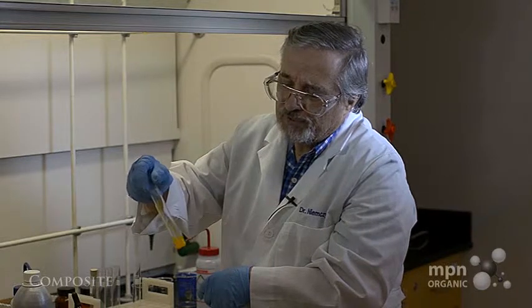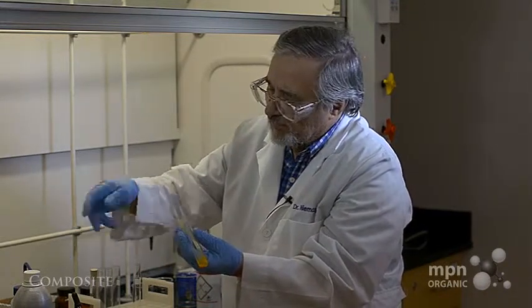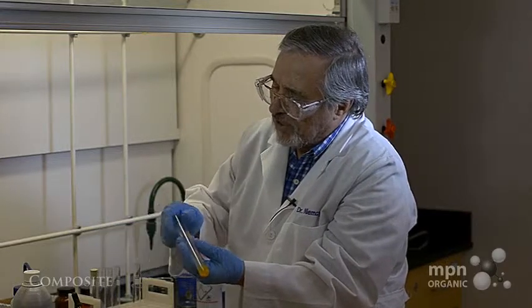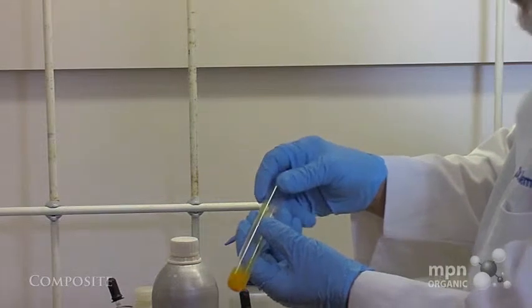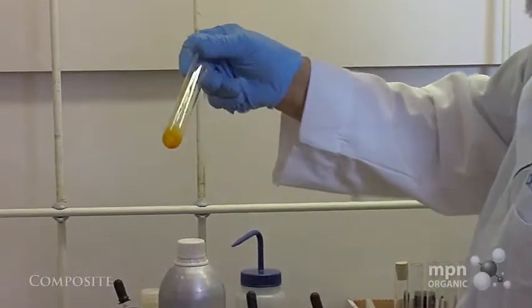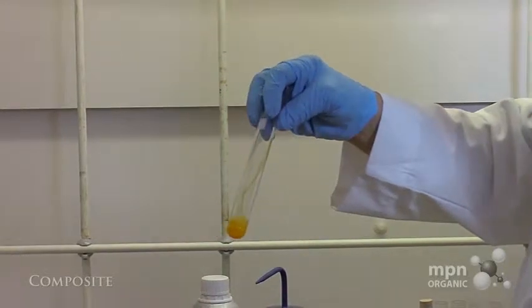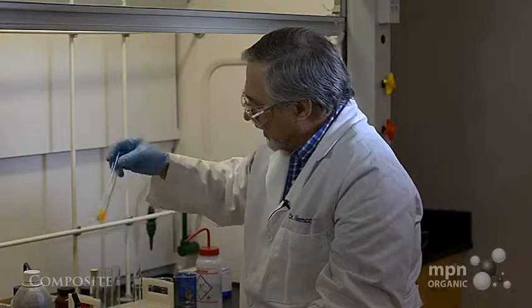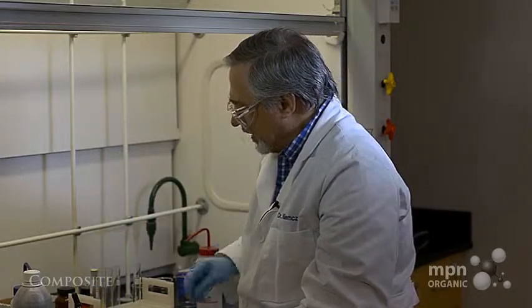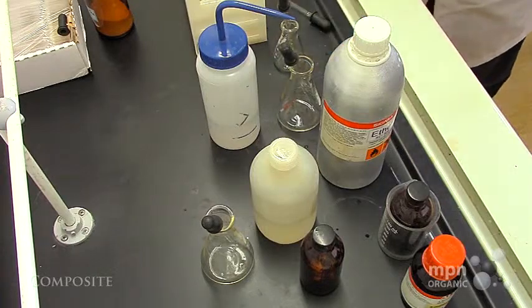So we've sort of confirmed, in this case, the oxidation of 4-methyl-2-pentanol with chromic acid, because here, in fact, we formed a 2,4-dinitrophenylhydrazone solid, which is typical of a ketone. Okay, so let's put that over there. And so that makes a lot of sense.